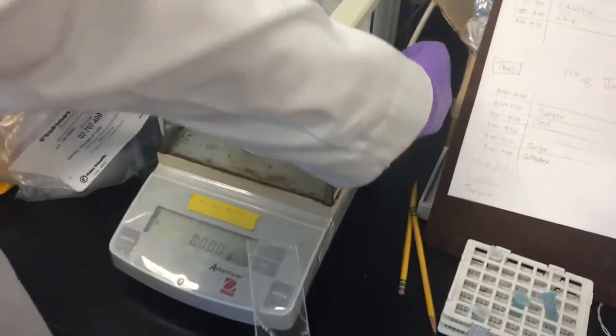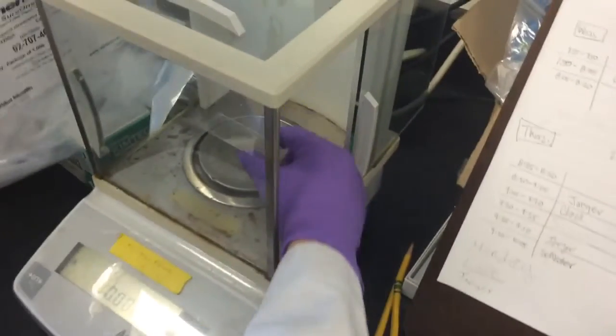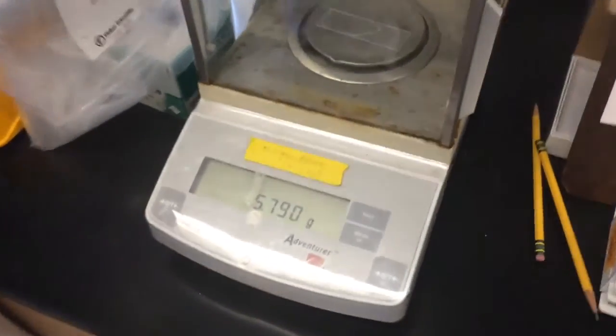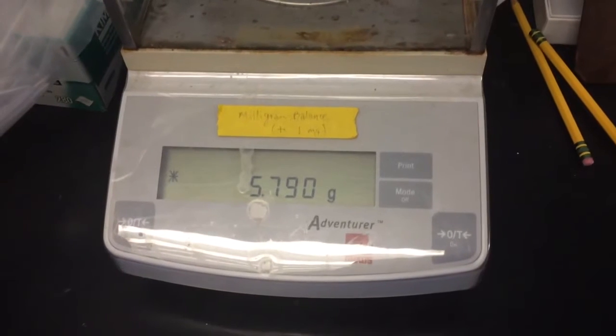According to the scale, the PEI layer weighs approximately 1 milligram. However, this mass could be due to a number of other variables. It may be that the PEI layer does not weigh enough to be detected by the scale.